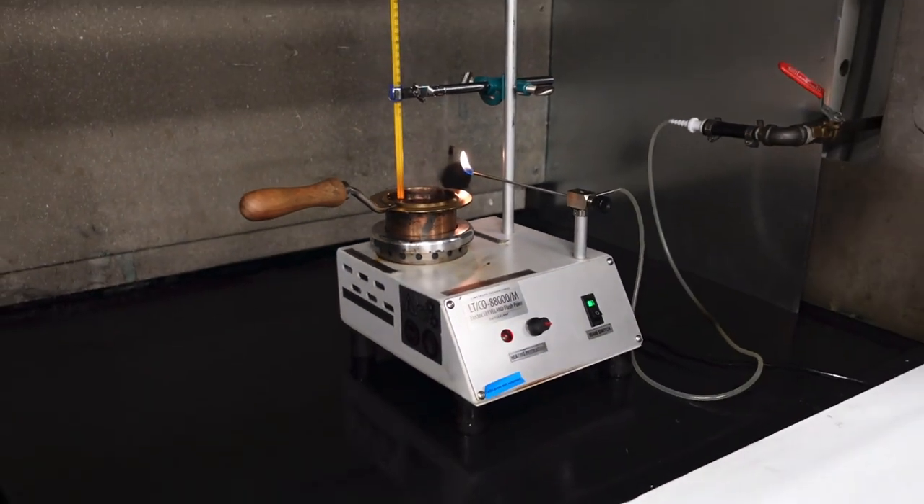You can hear it. Next, you'll be seeing a pour point test, which measures how cold the oil can get before freezing and thickening.